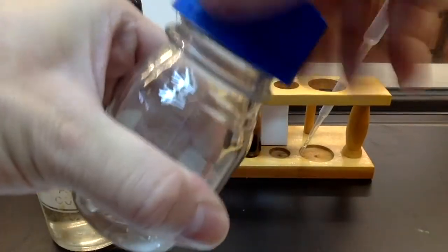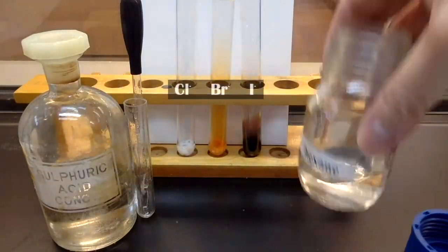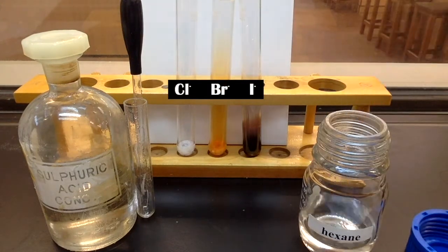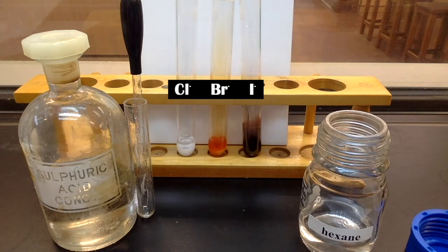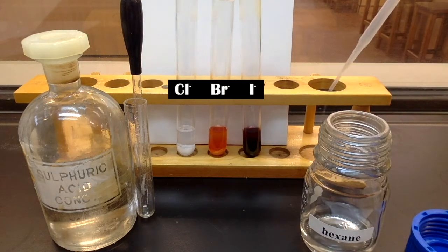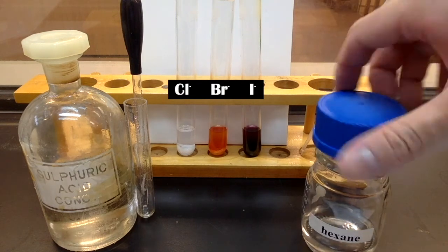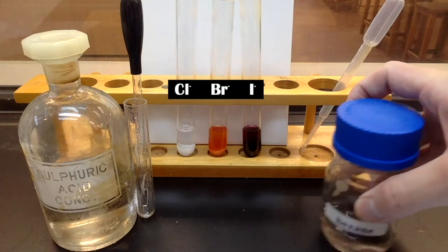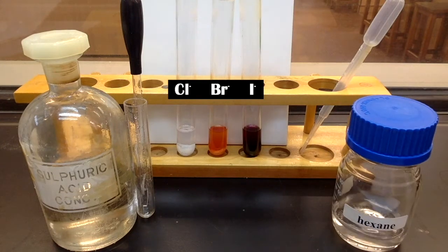Hexane was added as a confirmatory test. Bromine dissolved in hexane layer to give an orange color, while iodine dissolved in hexane layer to give a purple color.